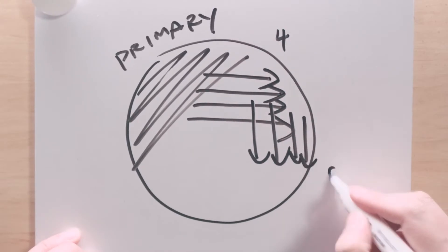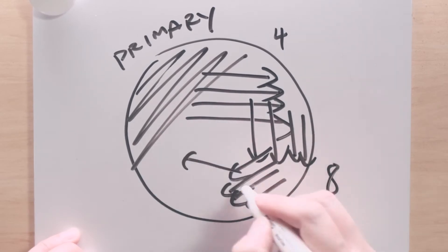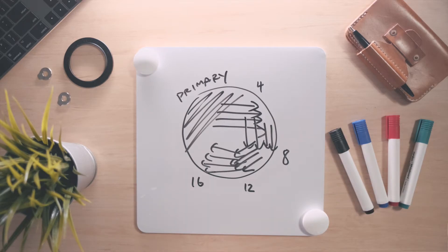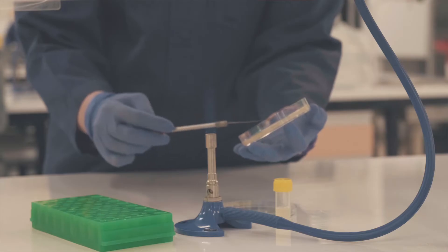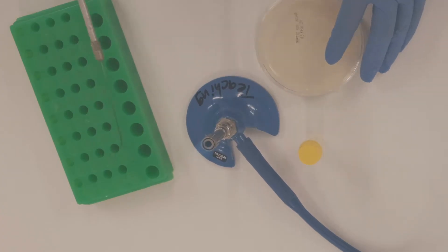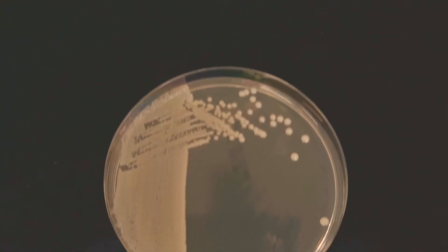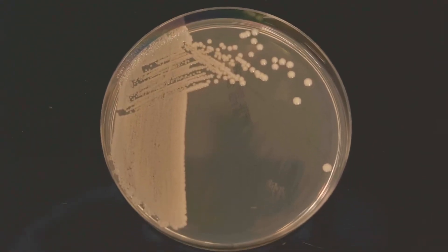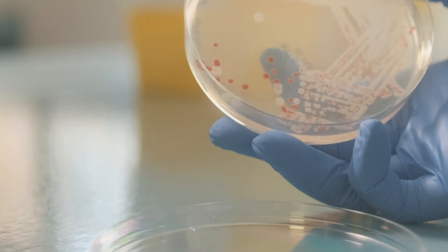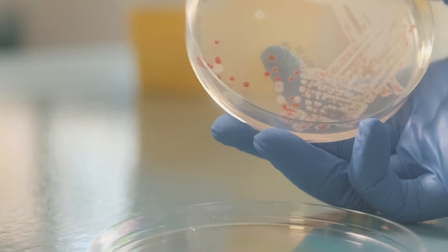Flame the loop again and this process is repeated for four sets of four streaks — a total of 16 streaks. Remember to work close to the Bunsen burner and flame the loop between each set of streaks. Here we see what the results look like after a period of incubation. Notice that individual colonies are visible towards the last few sets of streaks. In patient samples, we often find more than one type of bacteria at the site of infection.